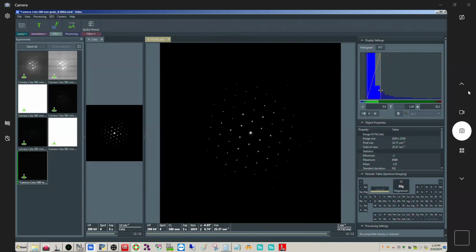And that looks pretty good right there. So now this gamma, it's actually doing a gamma off of what this gamma was. So this was a gamma of 0.5. So if you adjust this to 0.5, it's fudging this back. So you should be able to leave this on whatever this was before, but you have to keep that in mind if you do a series acquisition.